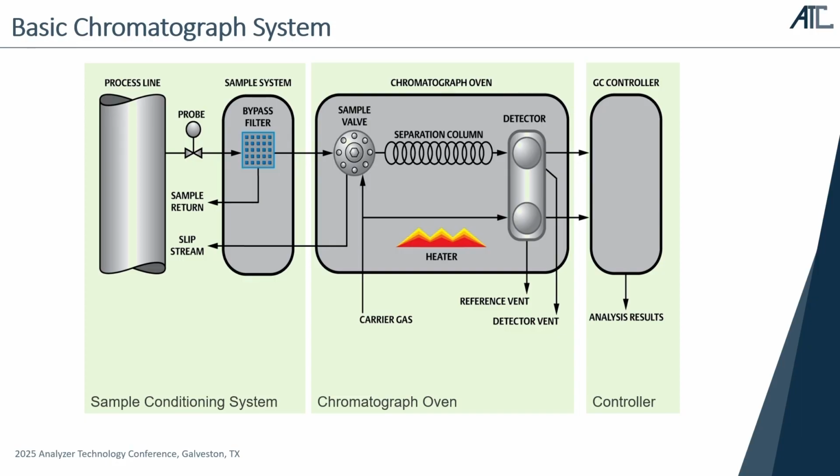When the sample goes through the column, the different components, some run faster than the others, just like running a marathon, right? First, they all come together, leave together, but then the faster ones lead, and some are just lagging behind. So after the components are completely separated, they elute through the detector one by one. So then the concentration of each component is determined there.